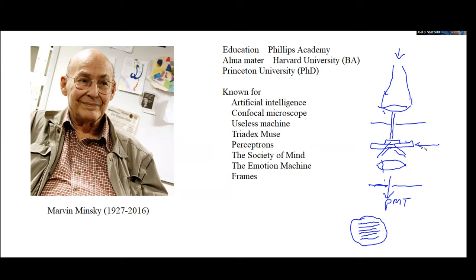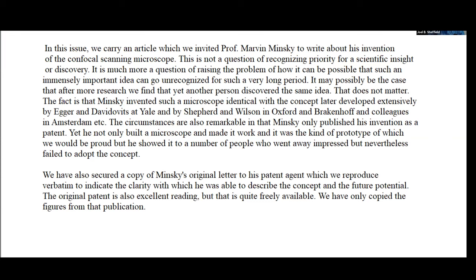But he never really had an image to talk about from it. Nevertheless, he is given credit as the person who founded the structure of a confocal microscope. His analysis of this, and as you know, I tend to think about this, this is the introduction to a paper by him, in which he finally came back to it.